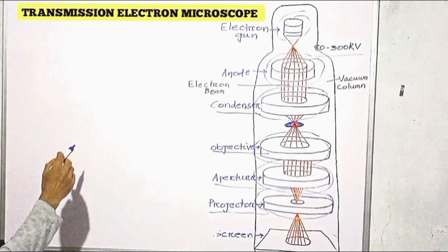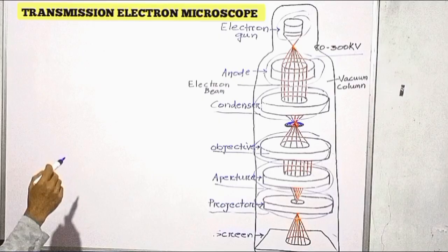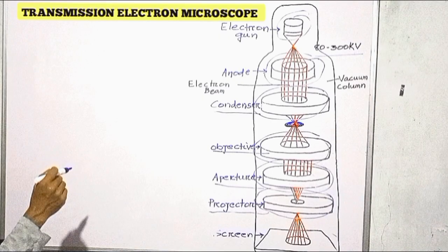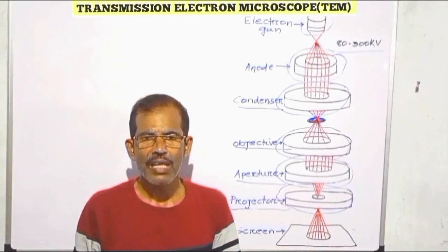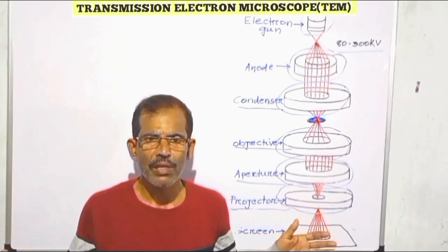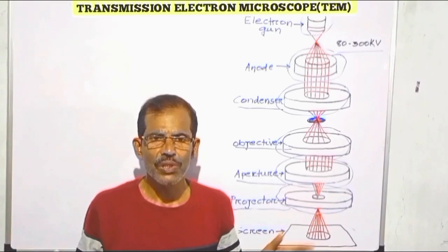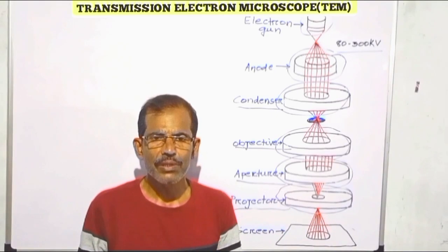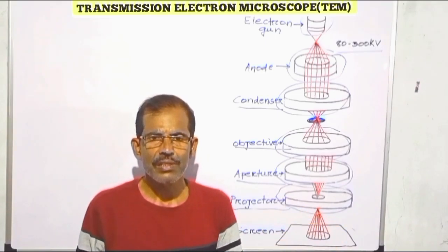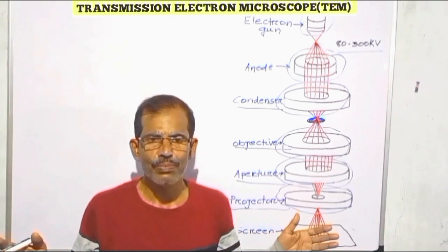This figure is a transmission electron micrograph which reveals the detailed internal structure of a specimen. Applications. The transmission electron microscope has several applications. For example, in biological and medical sciences, TEM is used to study and identify viruses such as SARS-CoV-2, and bacterial flagella and plasmids.